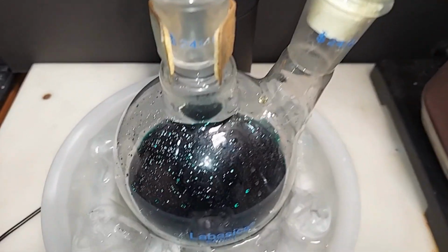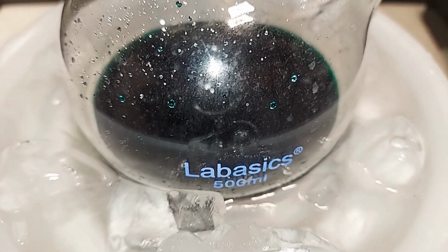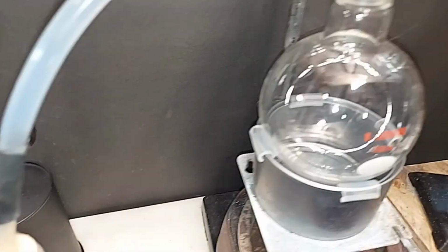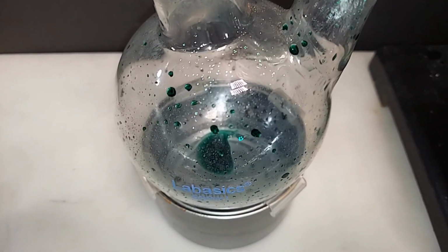2 hours are up and it's still stirring. You can barely tell in there, but it is. The top is just really smooth. So I'll be taking the placeholder out and putting that in its place. Last we saw, our magical green mix was in here, and I was going to just put this up here and take this one off.